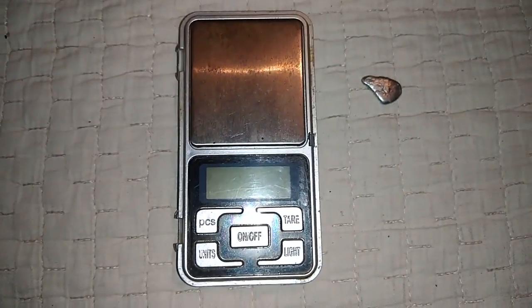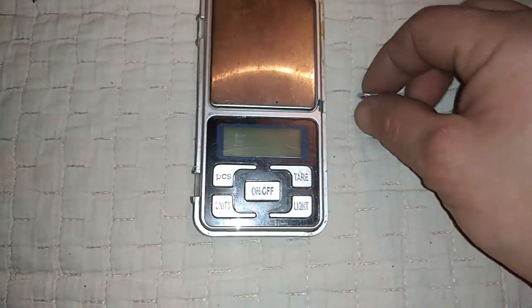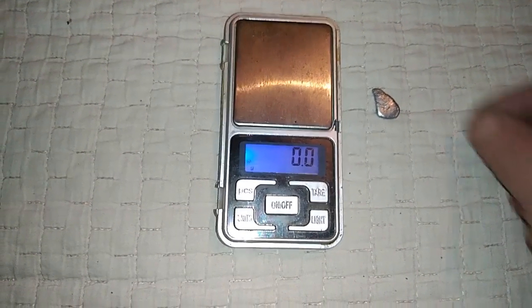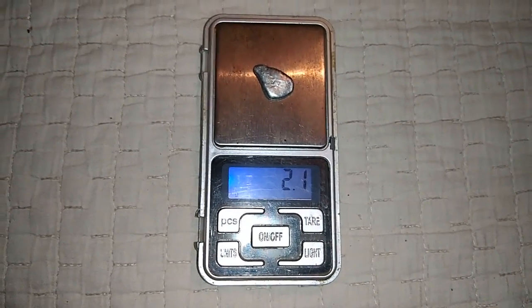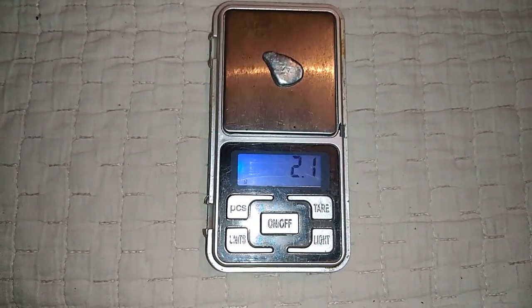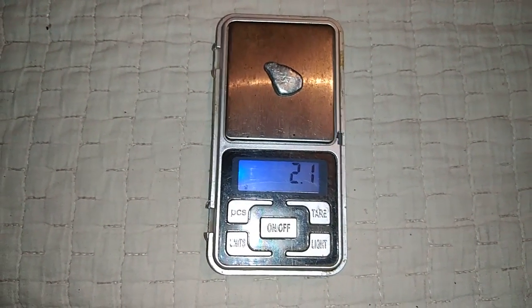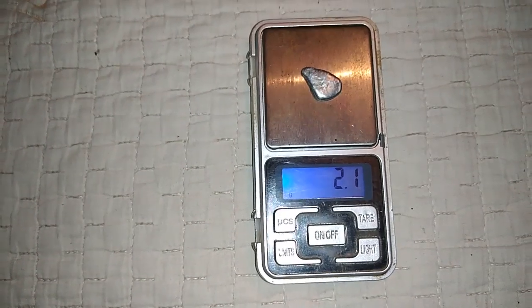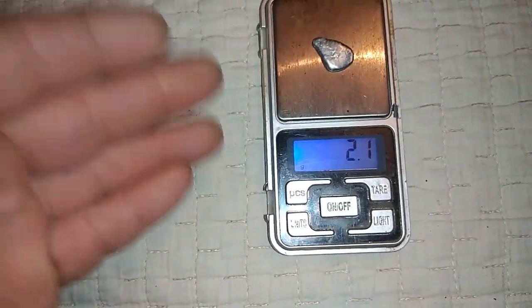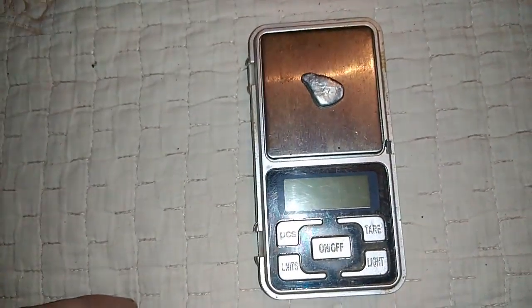Okay guys, I finished all the job for today. I melted that silver chloride and got this little silver bead. Right now I will add it to the scale — 2.1 grams of silver, pure silver from twelve x-ray films. Not too much of course, but not too bad. Just free silver. For you, probably the nitric acid costs more than this bead of silver, but for me I just found the process.